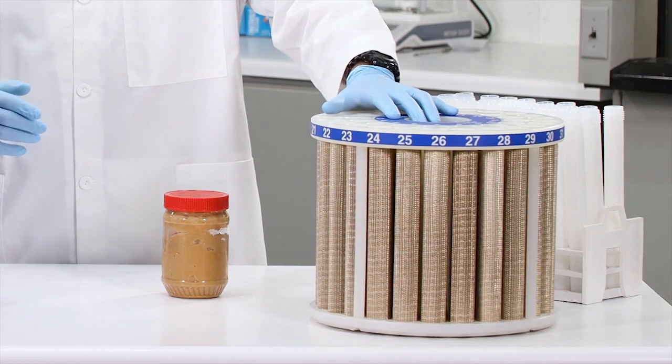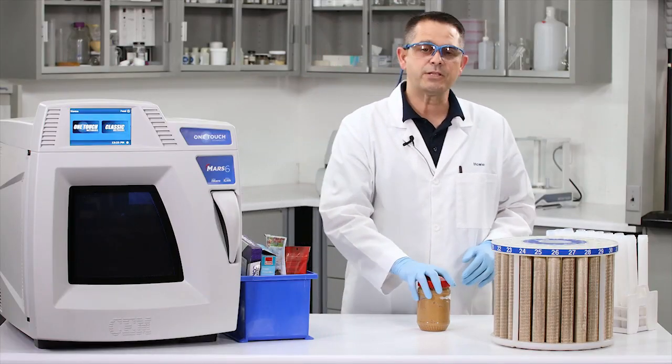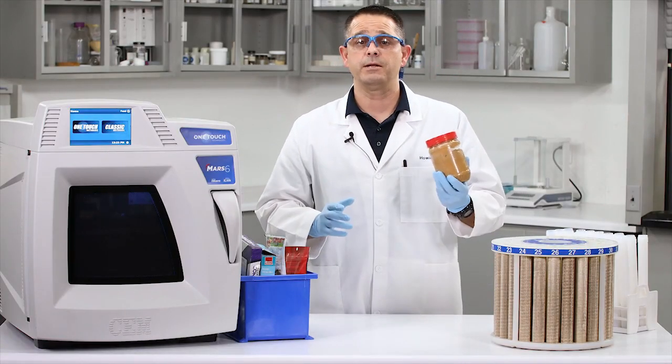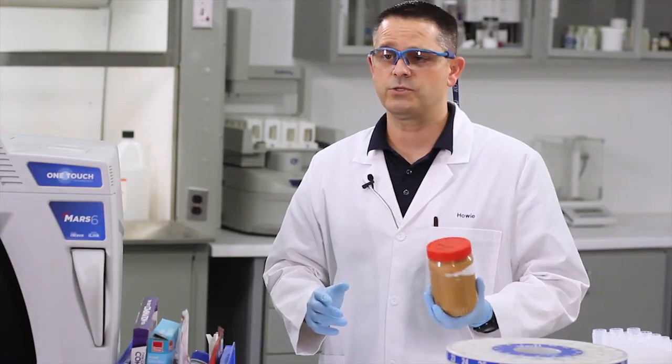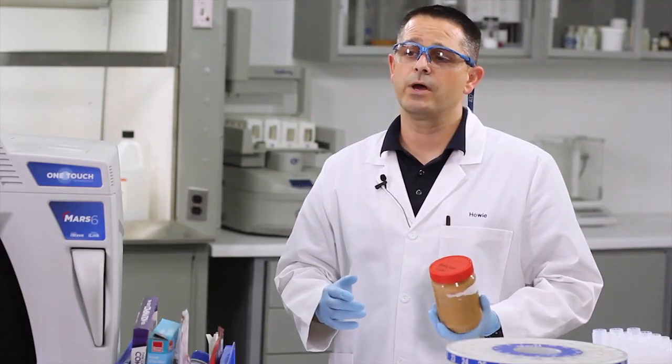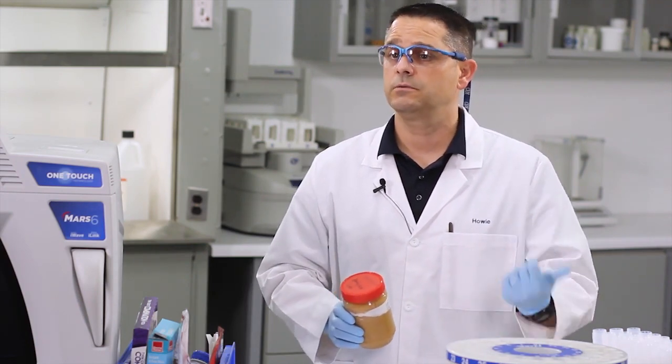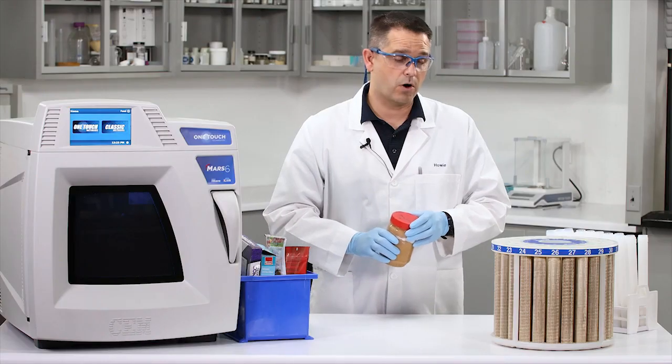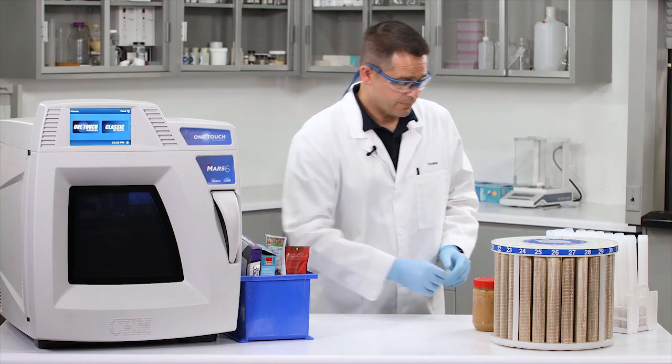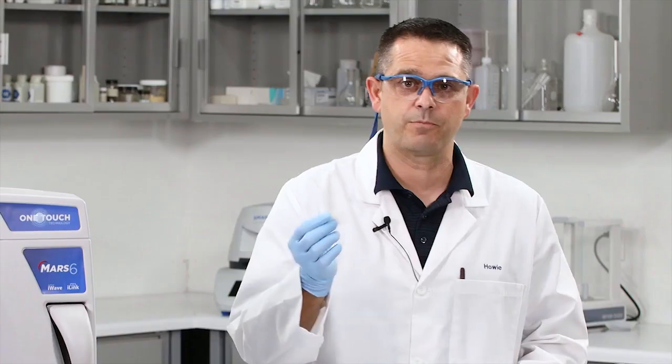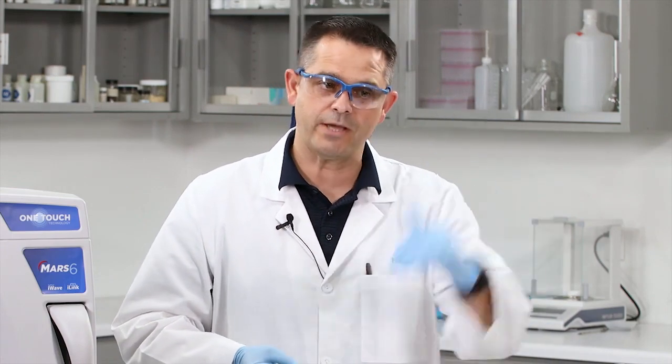As mentioned earlier, there's a couple of different ways we can do this with the peanut butter. One common way is to put the peanut butter in the freezer and then use a spatula to get it out. Today, we're going to use a cellulose filter paper and weigh it out, drop it into the vessel so we can make sure it gets all the way to the bottom.